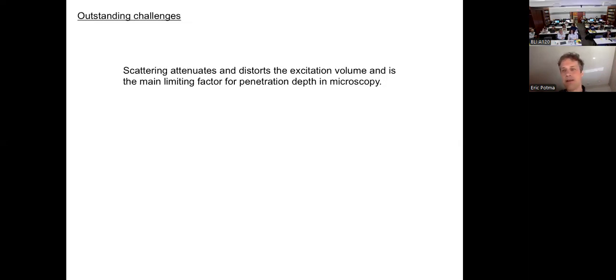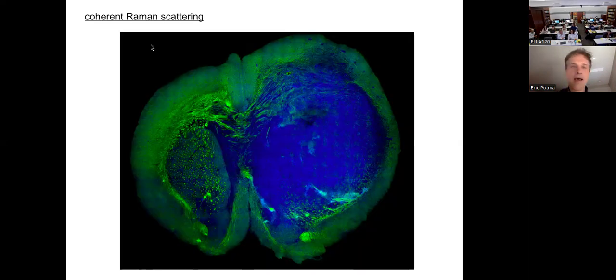Eric, how long did it take to acquire that image? This is a great question, Vasant. Let's say this is one little frame. You can see the little demarcation if you look carefully. Each frame takes 1 second, and then you have to add up. I think in all, this whole image probably took about 30 minutes. Wow, pretty impressive.